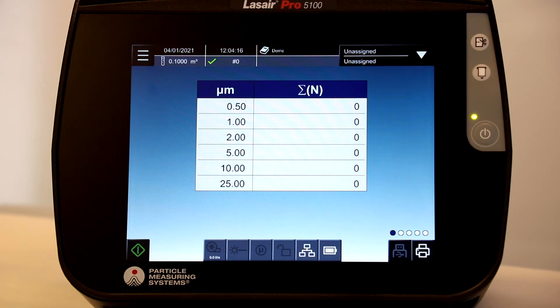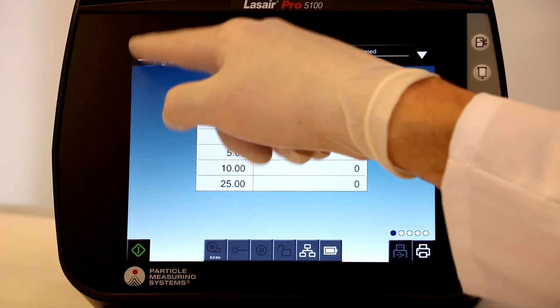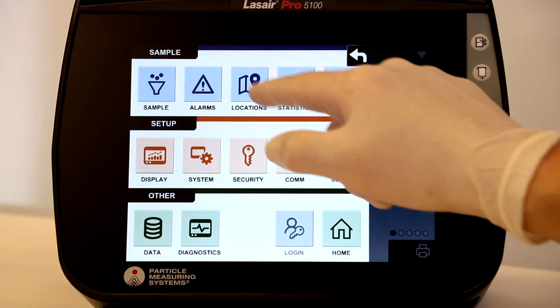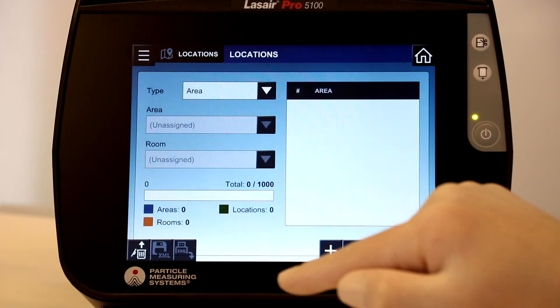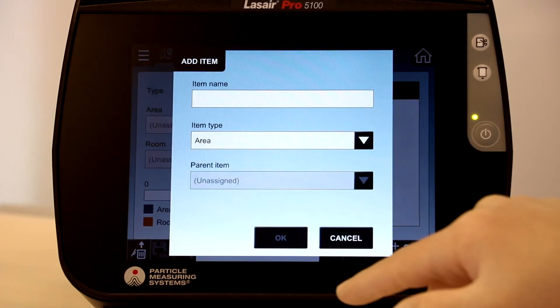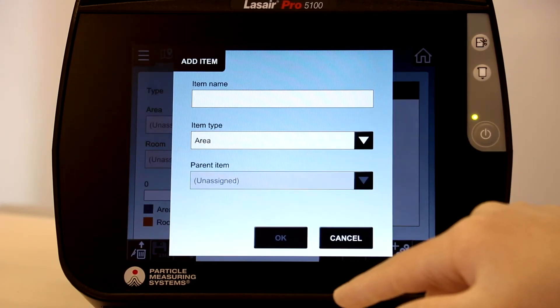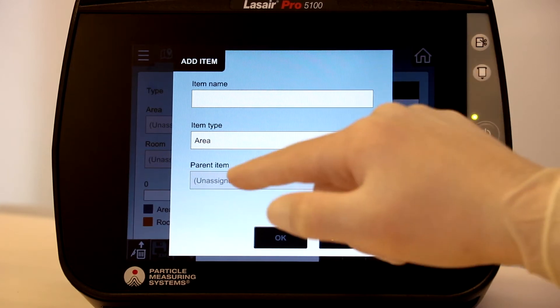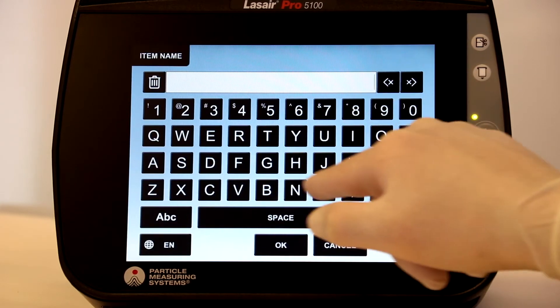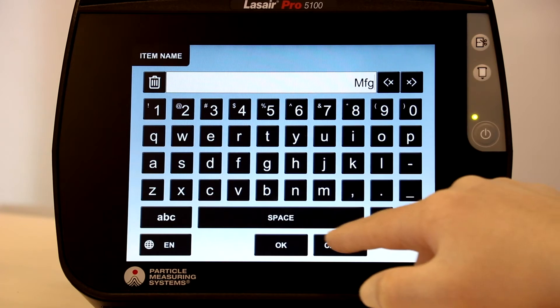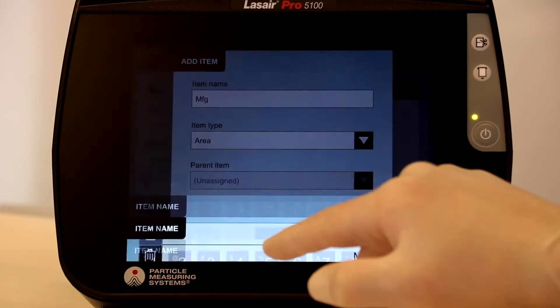After you have a recipe, simply click the menu icon. Here you can select the location icon. We'll start by adding an area. Select the Add button and then the item name bar and keyboard appears. Enter a name for the area and select OK.